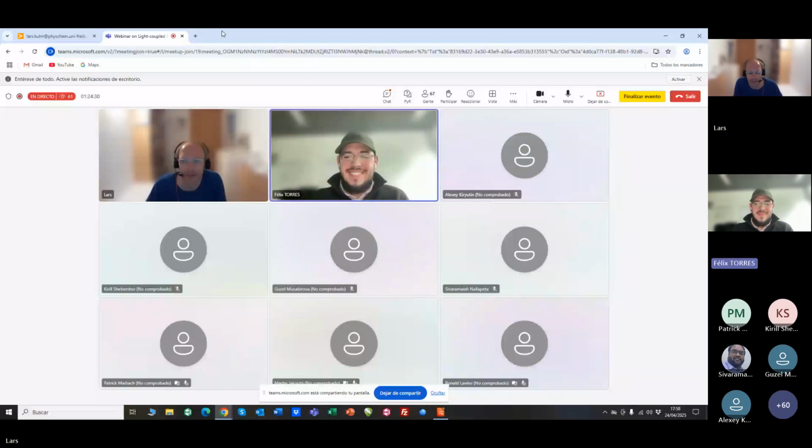All right. I think we have time for one more question. So we have another question from Covadonga Lucas Torres. Thank you very much for the wonderful work. Is it difficult to adjust the photosensitizer ratio considering how different metabolic concentrations could be in the biofluid?